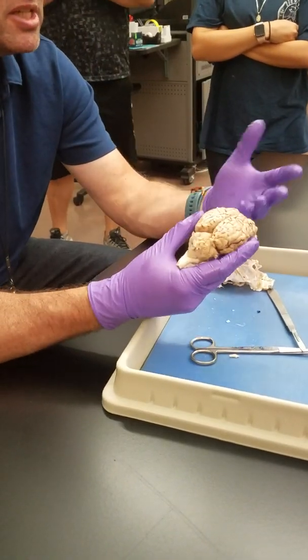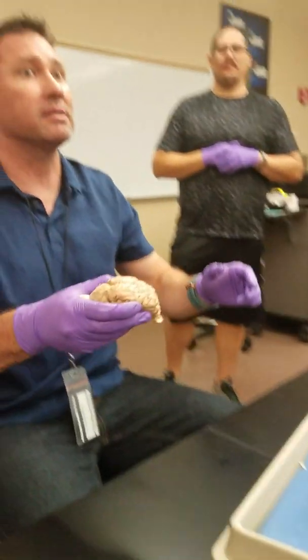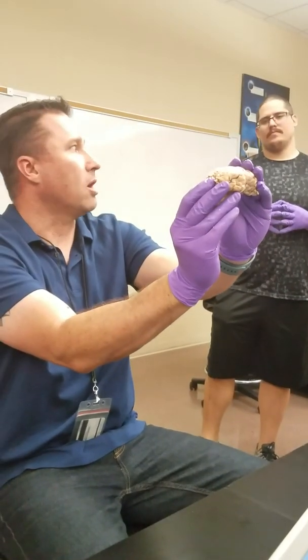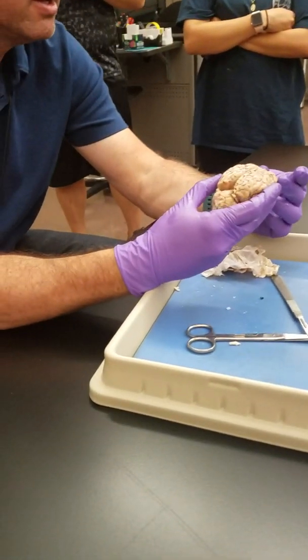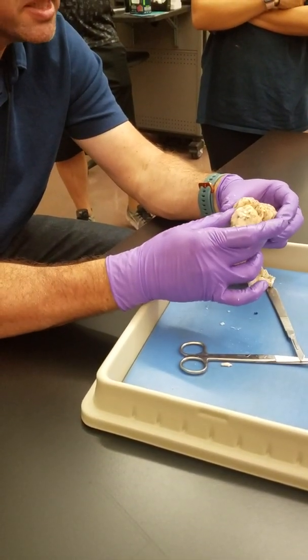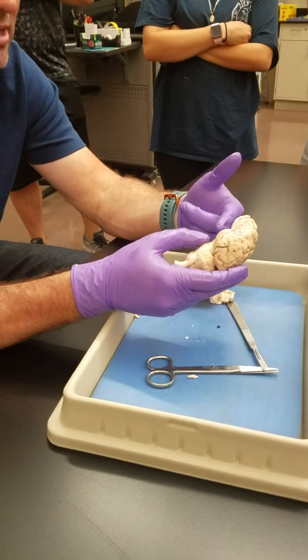Now, there's a couple differences between a human brain and a sheep's brain. Sheep are quadrupeds, so they're like this, whereas humans are up like this. So their brain stem goes back as opposed to being underneath like ours is. But you have all of the same lobes that we do: a frontal lobe, temporal lobe, parietal lobe, occipital lobe. Here is the cerebellum, and then here is the brainstem, and then tucked up underneath is the insular lobe.